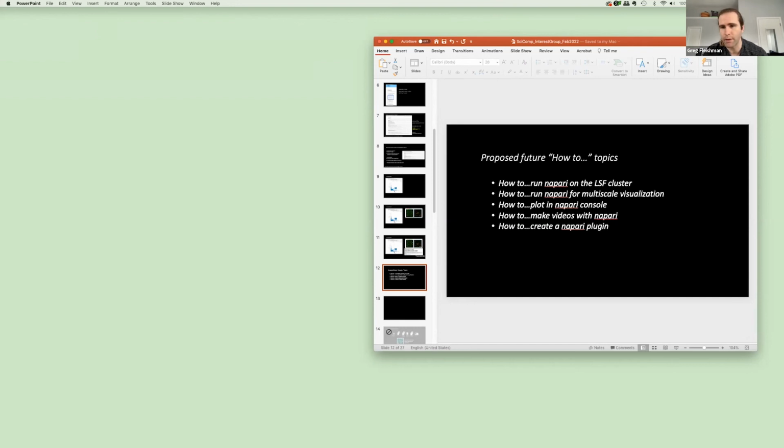They all have strengths and weaknesses, and I would love to do it with Napari, especially because you could share memory with processing in Python, right? Like draw your segment and then run some SciPy processing with your code in your notebook, reload the segment in Napari, and it's all very seamless. It would replace a lot of manual shuffling things around with files. Let's see, built my own PyQtGraph client, but would like to try with Napari.